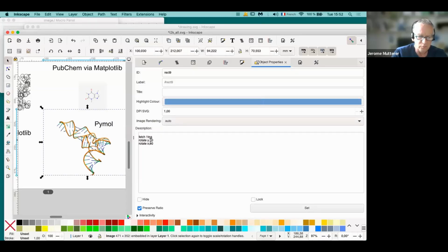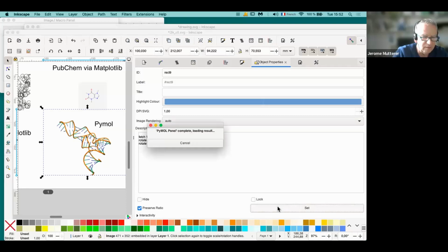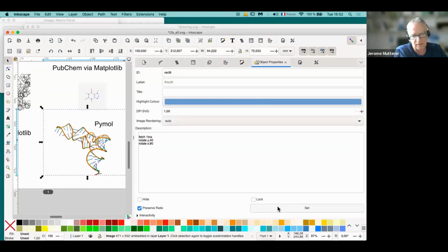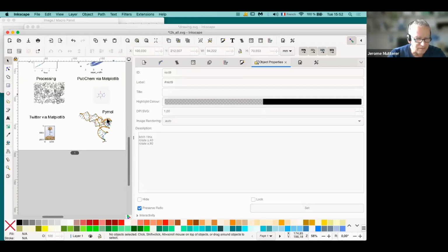And maybe if you want to rotate a little bit more, you should just add 10 degrees to this rotation and do it again. So now I'm not even going to the extensions menu, because I added shortcuts. So I'm just pressing one shortcut, and then I can slightly rotate this. If I want 2 different angles, it's even easier.